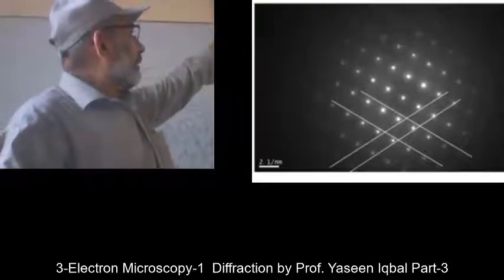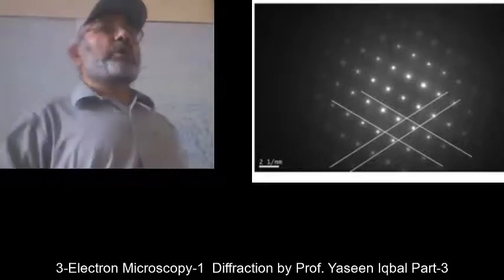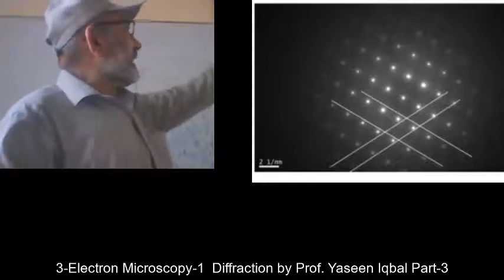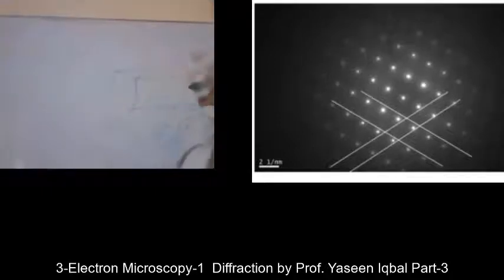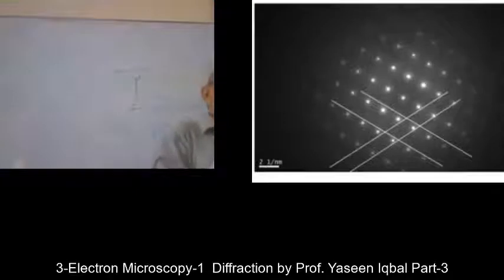Here, you can use the formula D is equal to L/Rm. L is the length of the scale bar. You measure it with a ruler or a micrometer and say this is, for example, 1.8 up to here centimeter, so that accuracy is not lost.